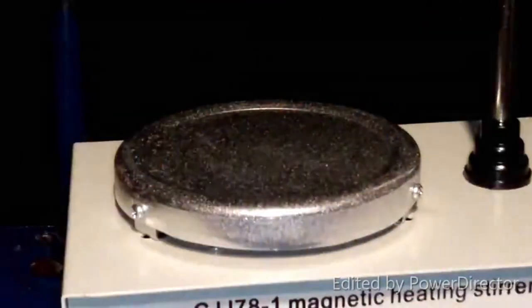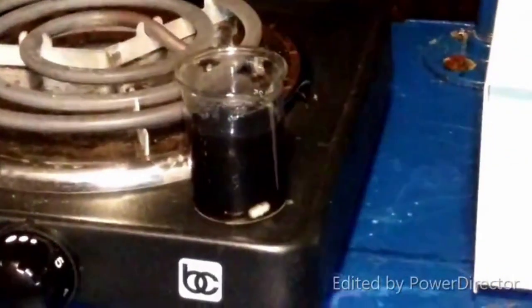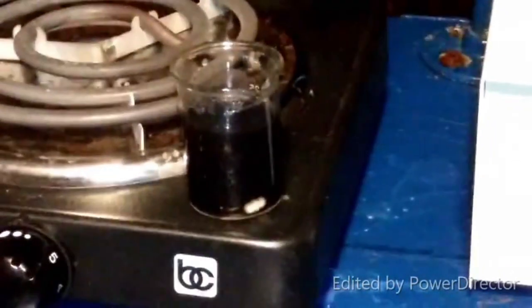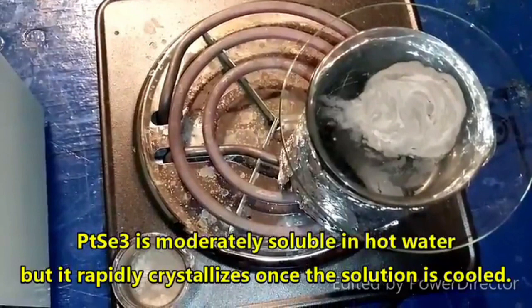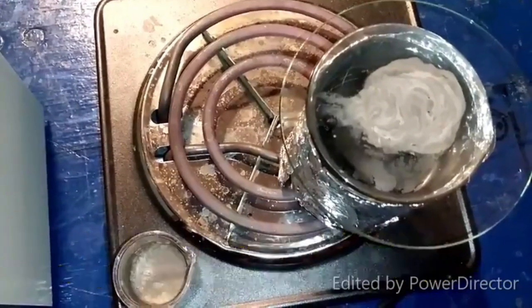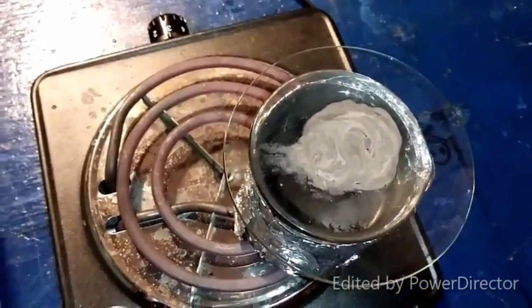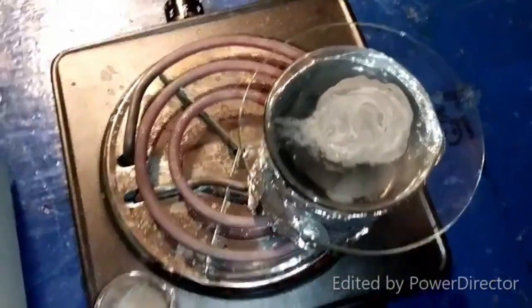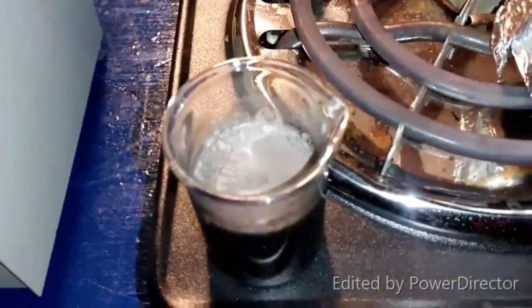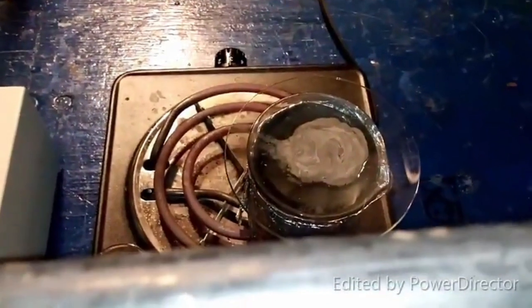Let's take this off the heat. Let's let everything settle. And I will come back here in a little bit, and we will see what we have got. Oh, that's so cool. Well, that didn't take long. Ladies and gentlemen, I give you platinum triselenide. As you can see, I'm evaporating it down here to get a crystal film, but this stuff crystallized almost the moment I poured it out into the watch glass. And as you can see, it is precipitating out all over the place here. So, platinum triselenide is pretty damn insoluble, especially when it's cold.